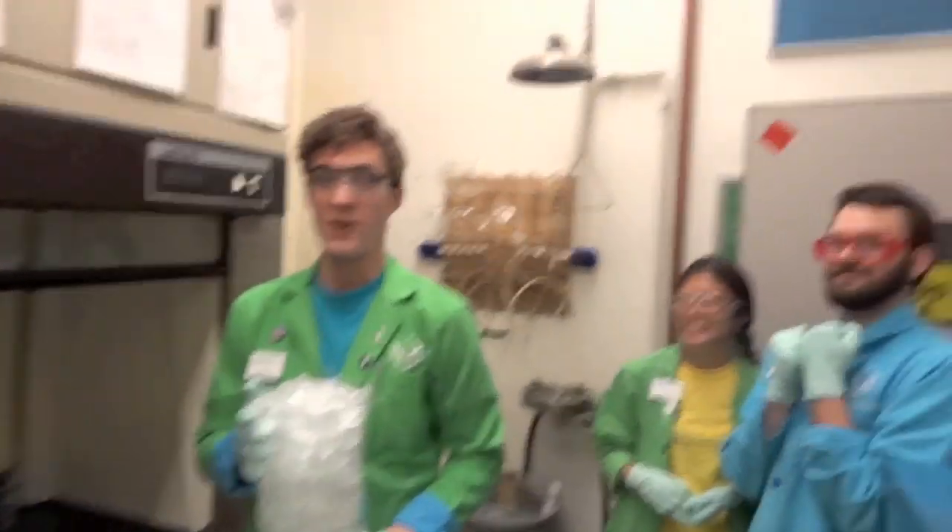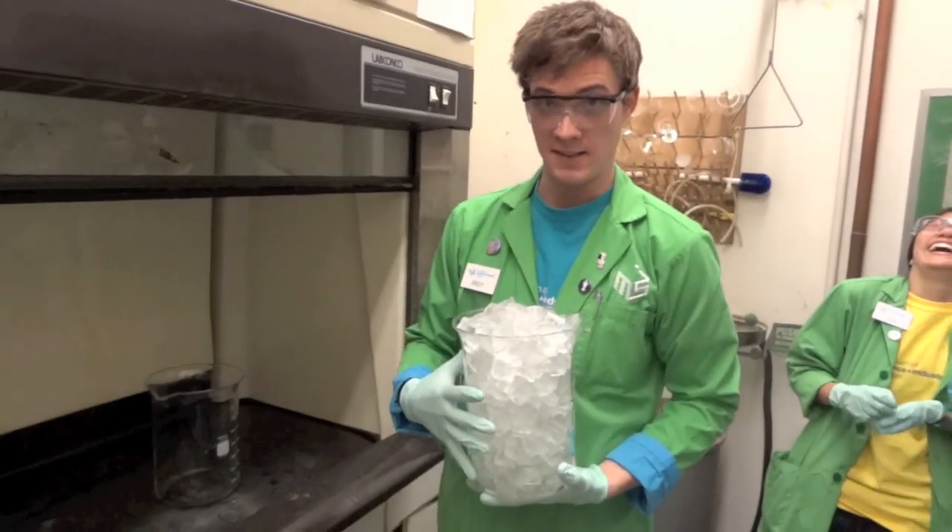Hey guys, we're here in the chem prep lab and Andy's going to show us a cool experiment. Andy. Okay, everybody. This is called the burning ice experiment.